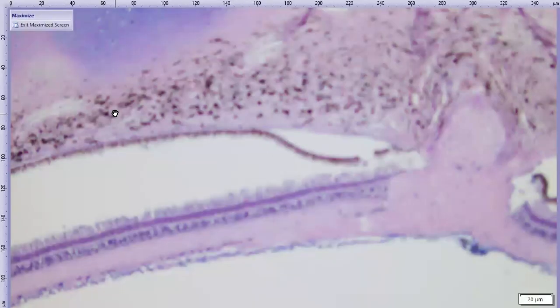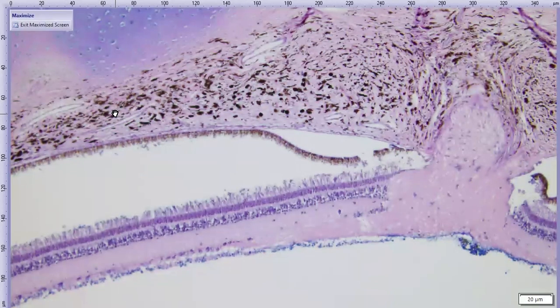You're going to have to take my word for it. We used this very specimen, using oil immersion to search carefully in the photoreceptors, and we found oil droplets and double cones. So they're both present in the monotreme.